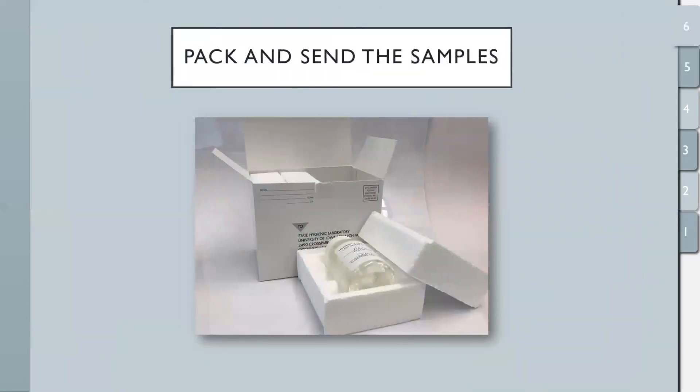Lastly, place the bottles back into their original packaging and put them, along with the paperwork, into the shipping box. The kit contains instructions on how to return the samples to the lab.